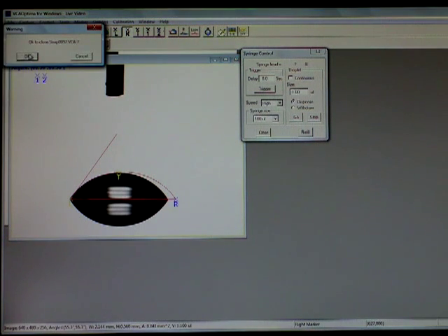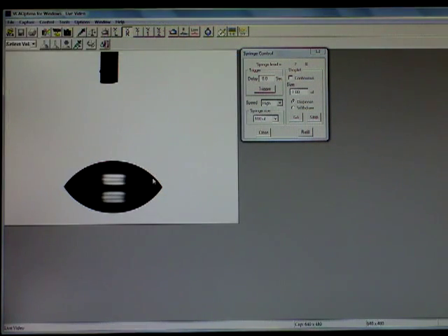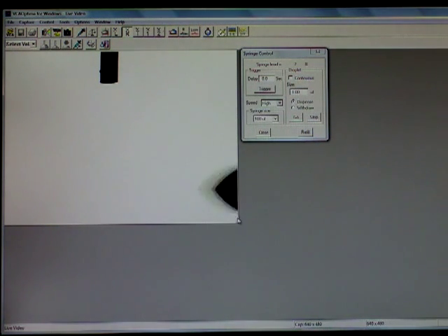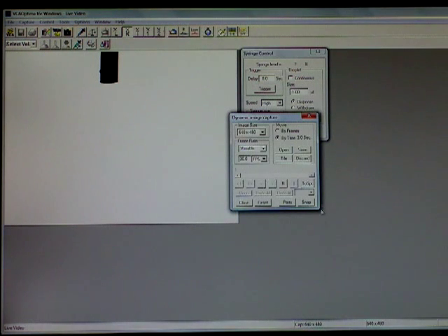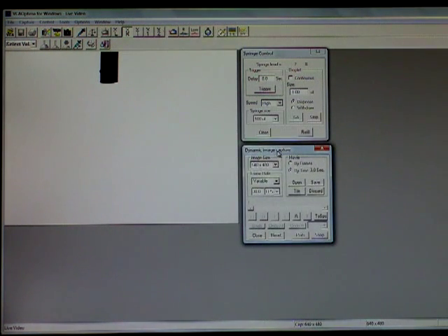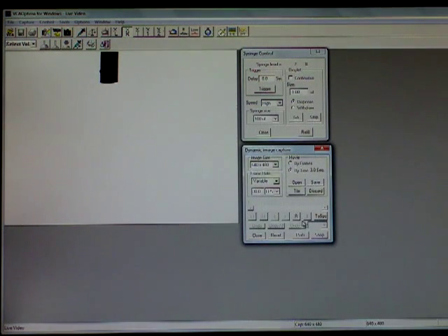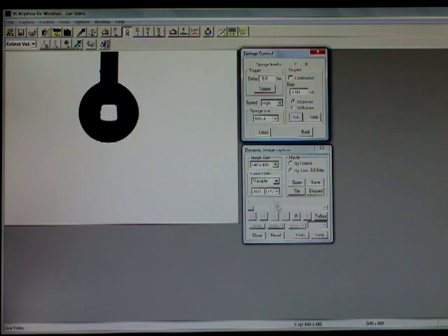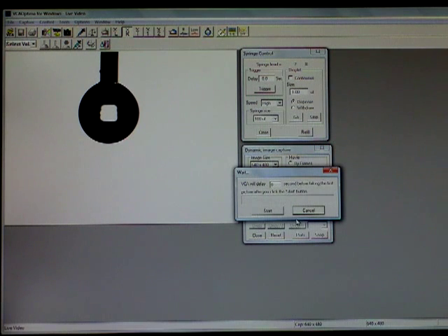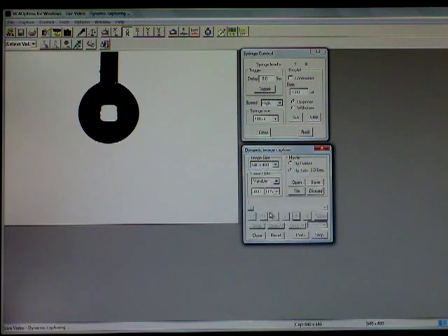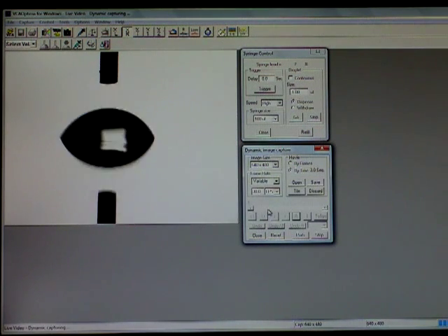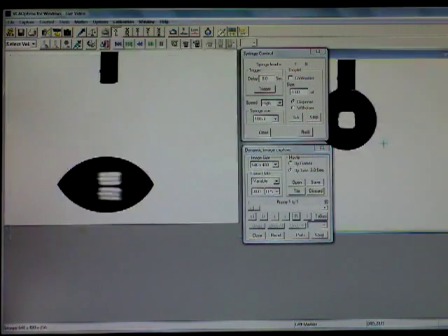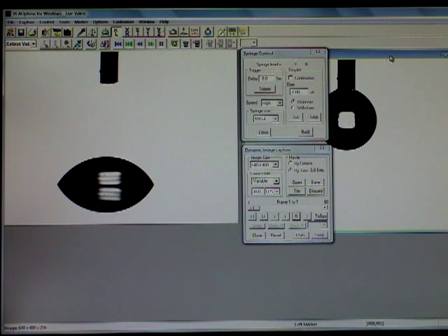Lastly, I want to show one more feature of the VCA Optima REC-Z which is the dynamic capture portion of it, which is a video. This takes 60 frames per second and right now I have it at 3 seconds. What I'm going to do is take a video and show you how it works. Hit record and the video is done.